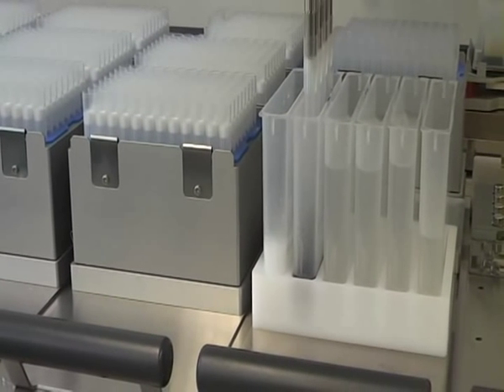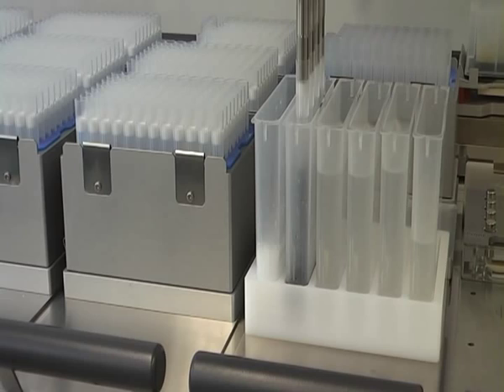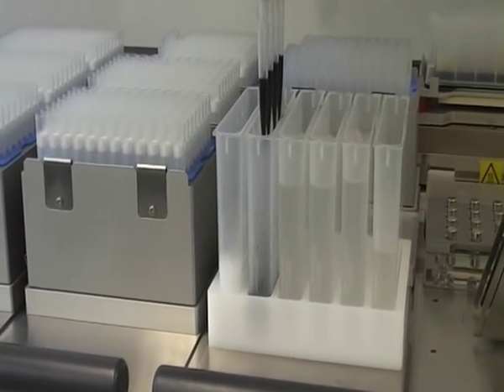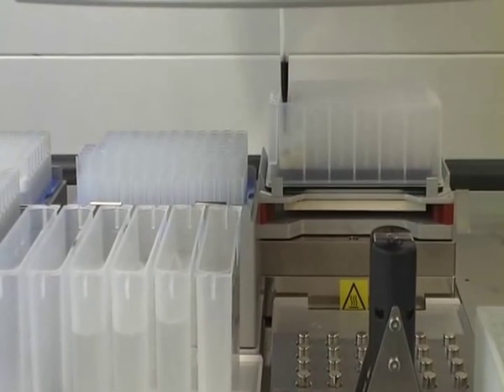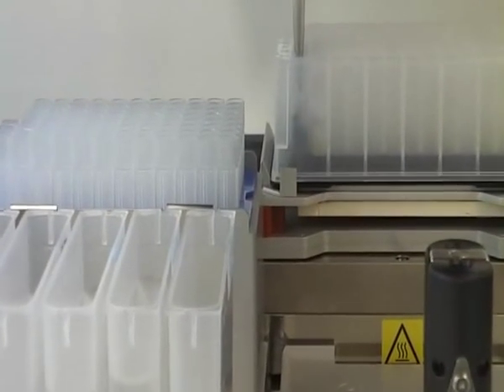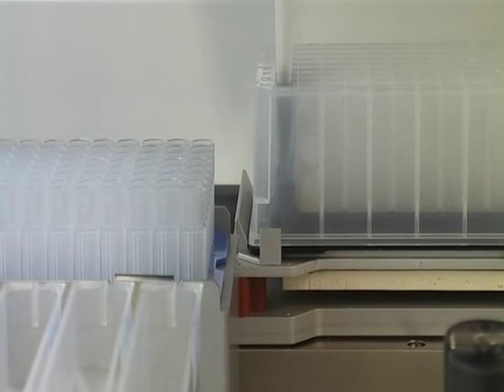In the next step, binding buffer is added to the wells. The black color of this buffer is caused by the magnetic beads, which give the Foodproof Magnetic Preparation Kit 1 its name. They are also responsible for the high quality of the DNA purified. As shown here, the solution containing sample and buffer is mixed by pipetting up and down.